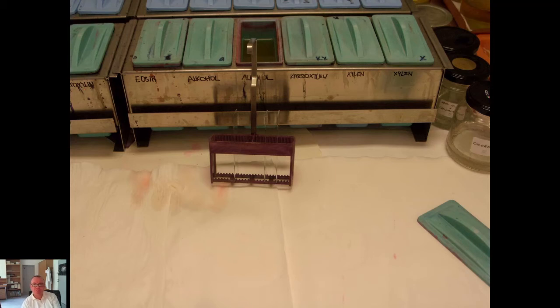You can see that in this set the hematoxylin and eosin was prepared. The tissue is on the glass, so this is the holder of the glass. Glasses are situated in this holder, and the laboratory assistant is moving this basket with glasses from one bath to another bath and then to another bath. Every time the time of the bath is also important, and at the end there is the stained specimen, stained and dehydrated and cleared specimen.